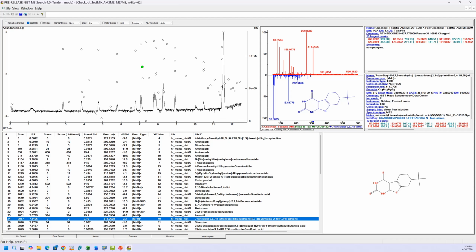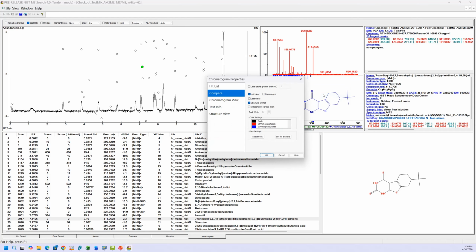So I was looking at the next topic, exception and zoom. Structures would be the next thing I wanted to talk about. You can see there's structures here, and I think when the software comes, it doesn't have that shown. So you have to right click, go to properties, and say structure on plot. And that's my favorite way to show the structure.